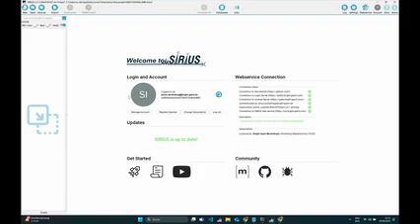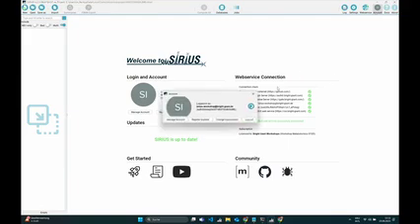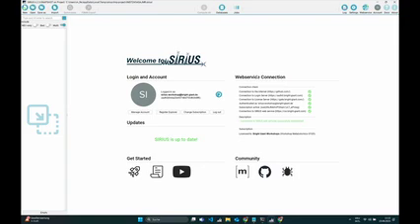And so now we already logged in. For everybody that hasn't logged in, you can just click on this account button, and then you will be able to enter the credentials to log in. And ideally, if everything also works with the internet connection, you will now see in this dashboard view that there will be green arrows. So I hope everybody can connect to the internet.